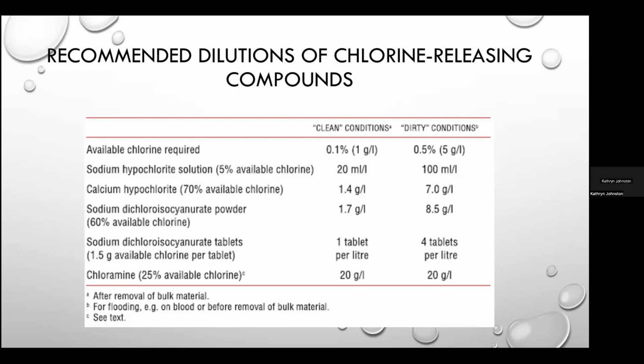Bleach may be used as a general purpose disinfectant for soaking metal-free materials. Remember, it's highly corrosive to metal, so you shouldn't use it on anything metal, not even to wipe down metal components. Bleach has to be stored in a well-ventilated area, and bleach must never, ever be mixed with acids, because it will release chlorine gas, which can be highly toxic. As a general rule, bleach shouldn't be mixed with other agents.